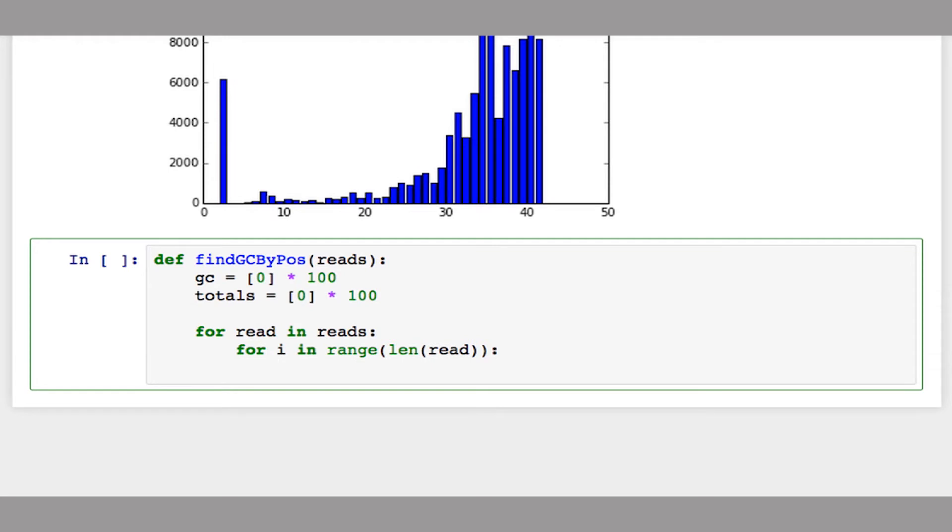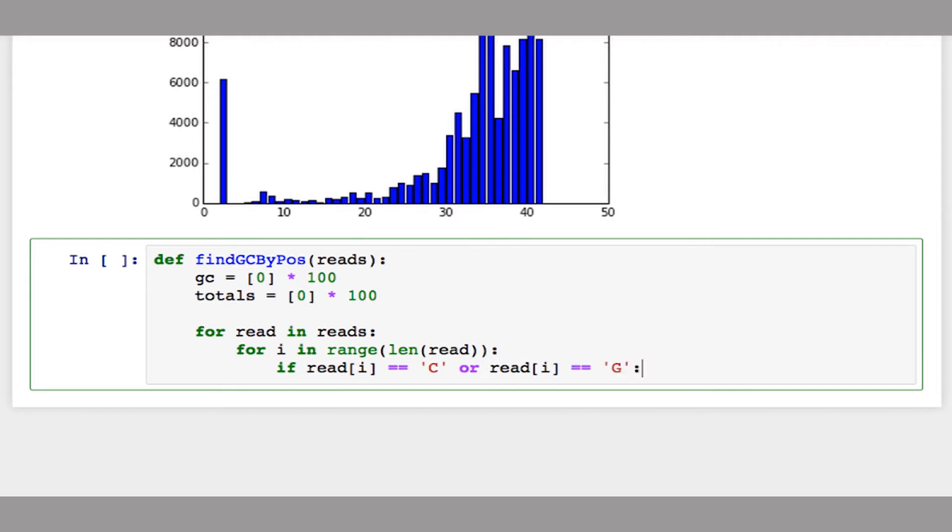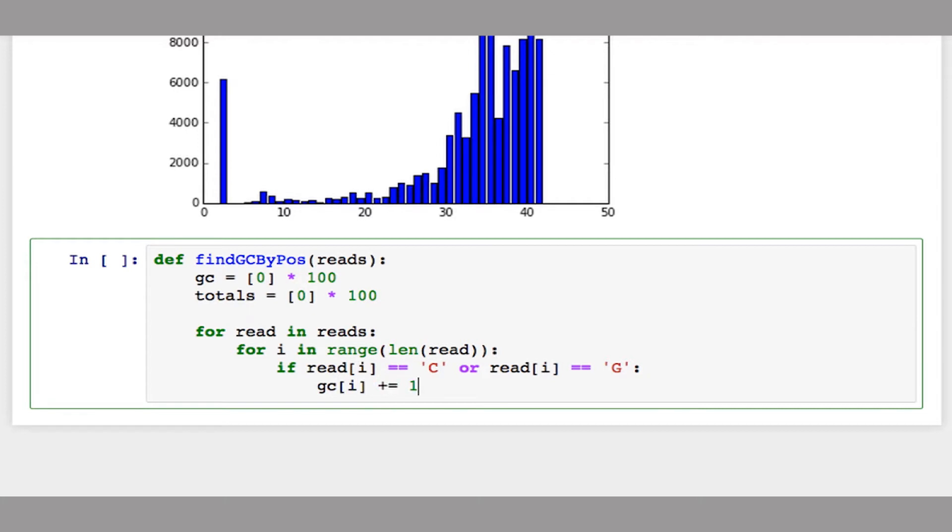First I'll check if that base is a C or G. If read[i] equals C or read[i] equals G, then I increment my GC array at index i. Regardless of what the base is, I increment my totals array at index i.